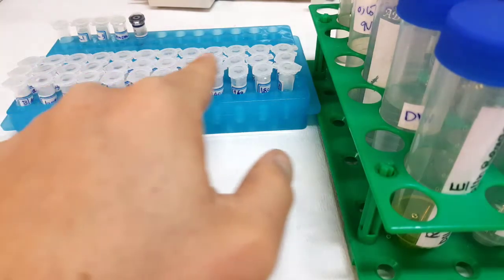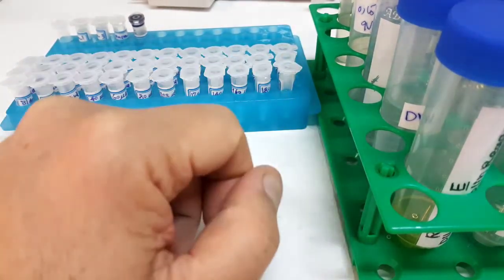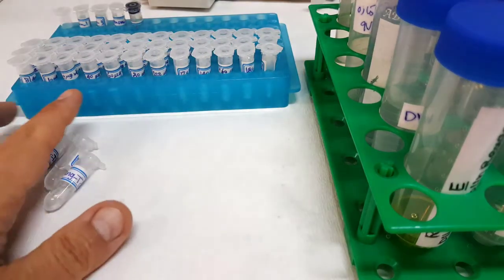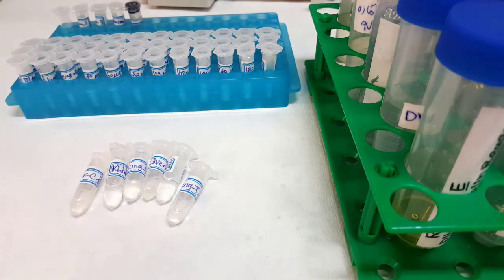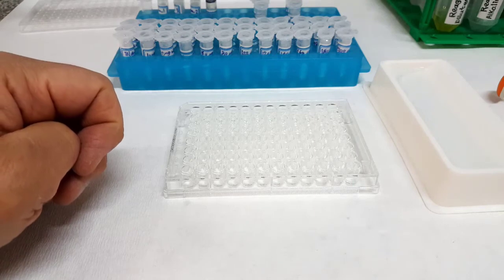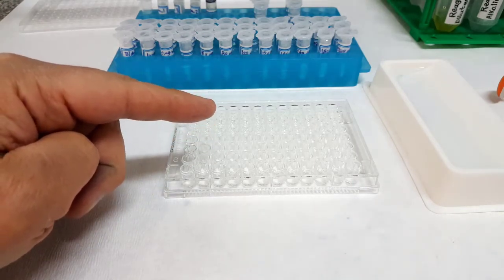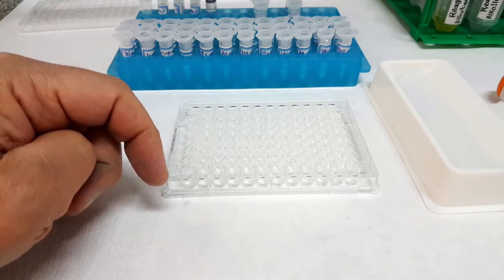Bovine serum albumin or BSA standards in triplicate, and supernatants from previous experiment. In each well of a 96 well plate, add 40 microliters blank, standard, or sample, followed by addition of 200 microliters of reagent C. Blank is distilled water.